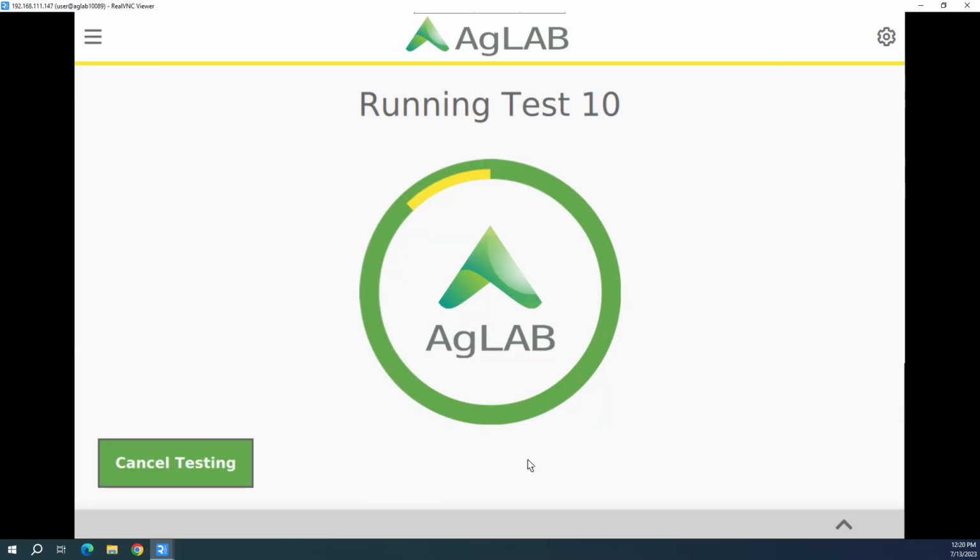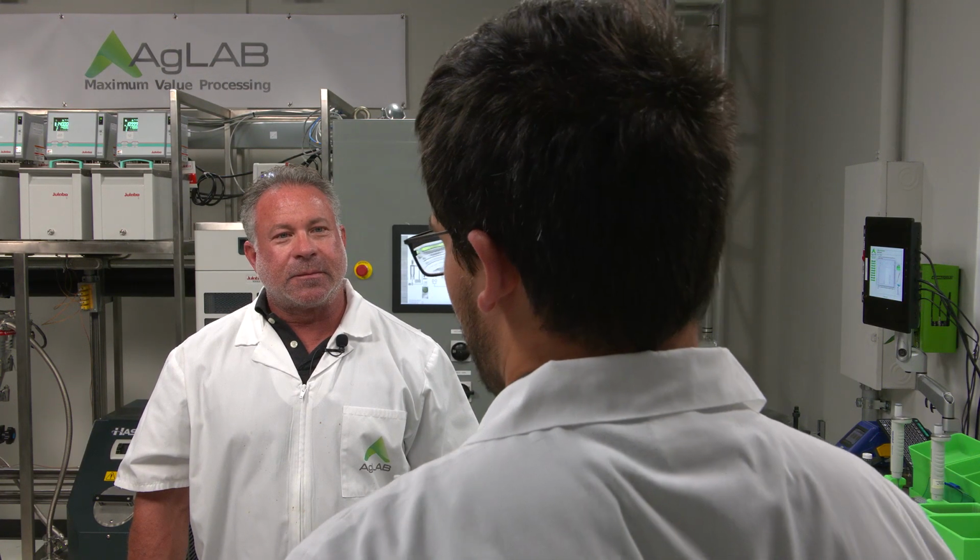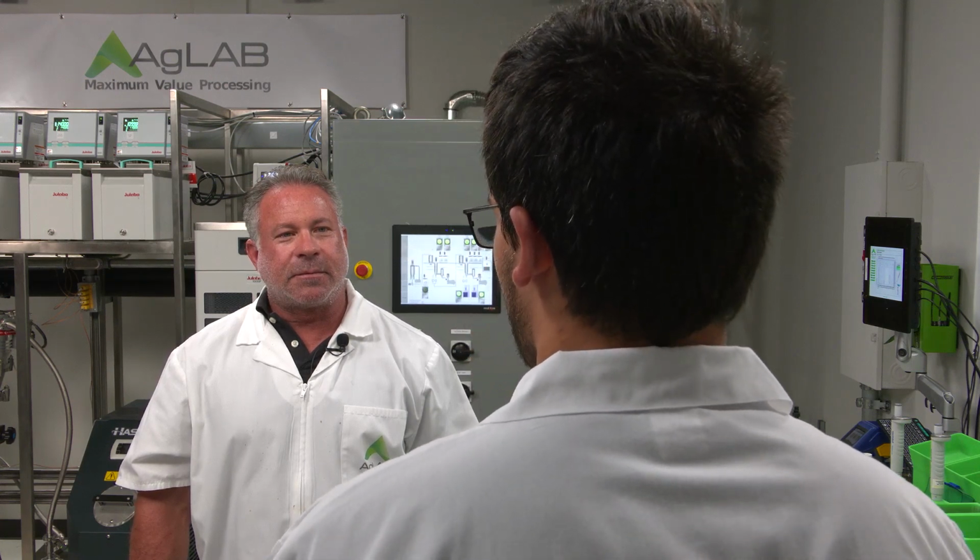So Joe, if we stripped off our terpenes and we see some cannabinoids still in there, that tells us that we're probably cutting deep enough to collect all of our terpenes. So we already stripped those out. Why are we still running the condenser at 90 degrees? Why don't we just go with like 30 degrees so that we can be more efficient with collecting the CBD?